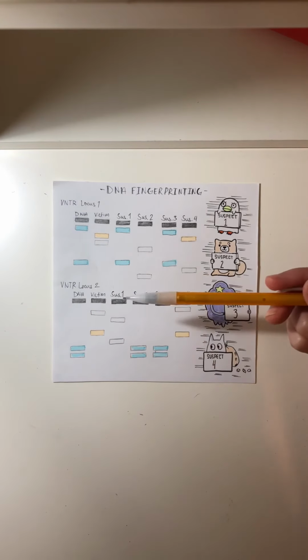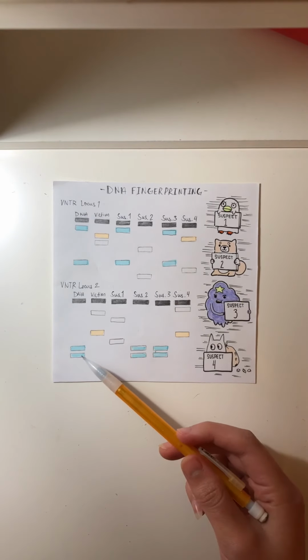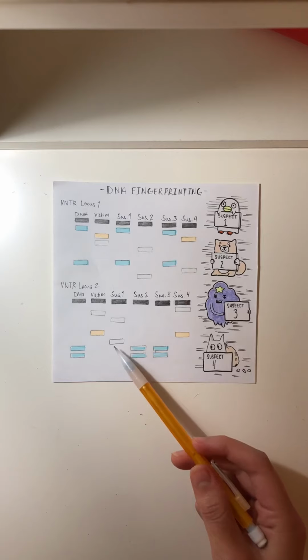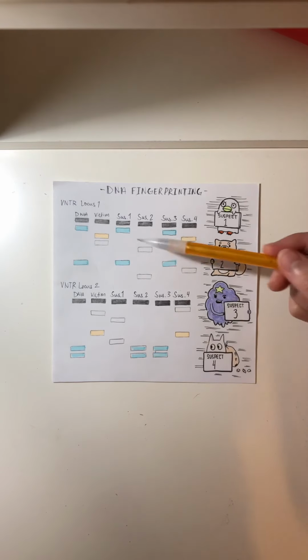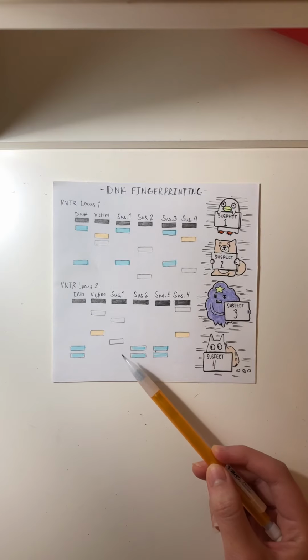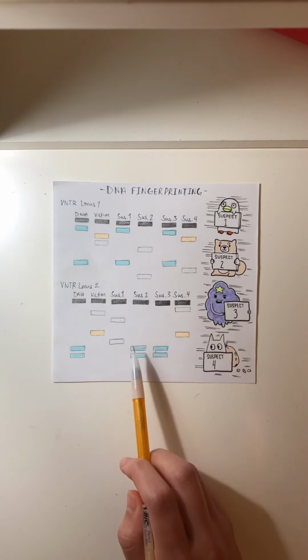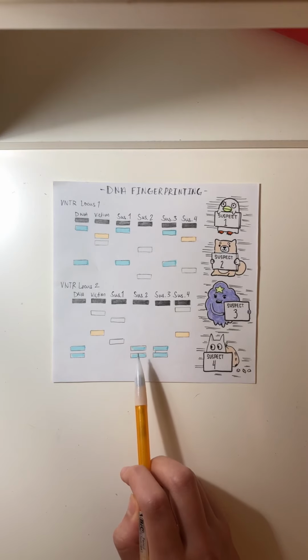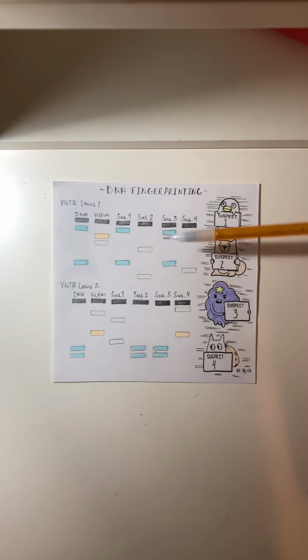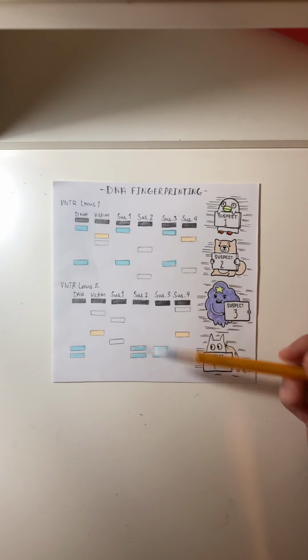And then looking at locus 2, we see here that our DNA is now down here, and looking at suspect 1, who was originally matched, they do not match anymore. So suspect 1 is crossed off the list of culprits. And suspect 2 matches in our locus 2. However, in locus 1, they did not match, so our suspect 2 would also be crossed off.